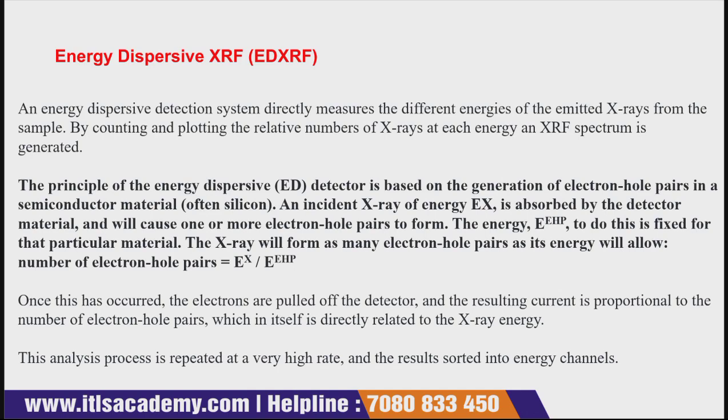The energy dispersive spectroscopy is also known as the EDS technique. It is mostly used for the qualitative as well as quantitative analysis of material, but it is also capable of providing a semi-quantitative result as well. So it is not always the case that it is only used for qualitative analysis of the material. No, it is for both qualitative as well as quantitative. Okay, so what does it mean? Let us understand with the help of a definition.